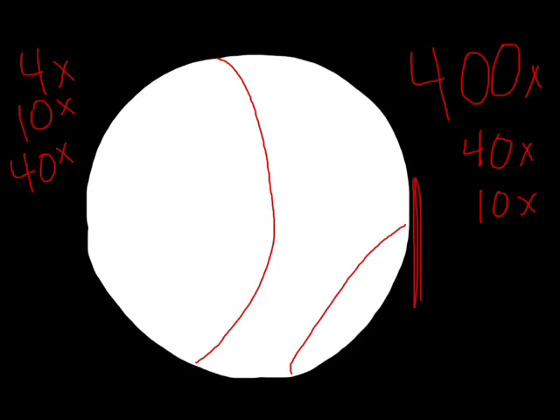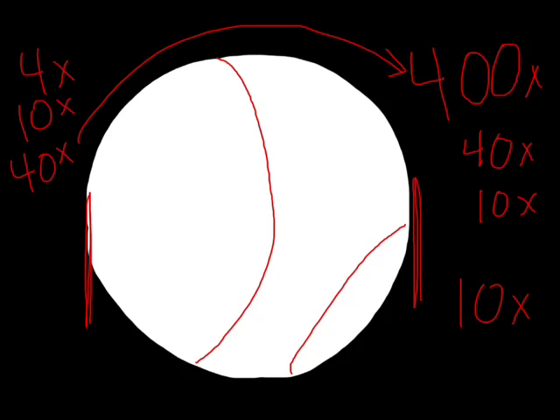And because we went up from 40 to 400, it's a power of what? 10 times? And we know that we saw originally 5,000 microns was our field of view, but because we went up in magnification, we got closer, so our field of view was cut down by the same rate, 10 times.